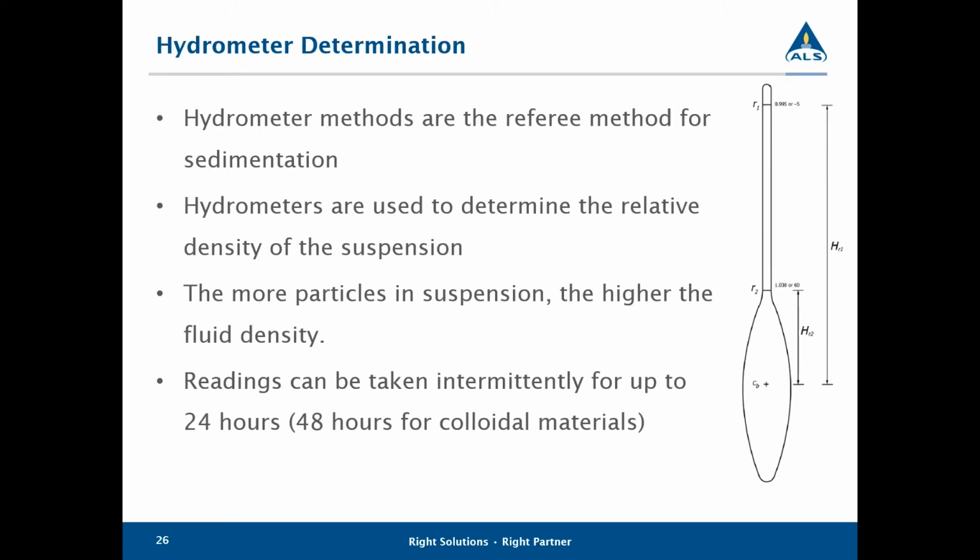The hydrometer method is the typical referee method for a number of different regulators and a number of different labs. As the referee method, it is a method that a lot of people need to apply, and most of our labs offer this. The density of the solution is measured using the hydrometer, and then we use calculations to refer back to the actual concentration, or the percentage of the material in the solution.